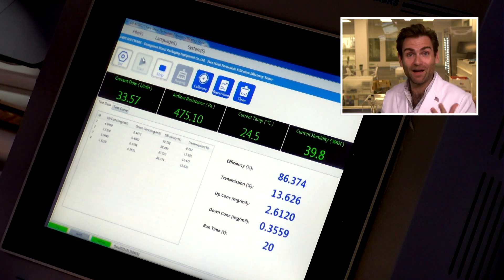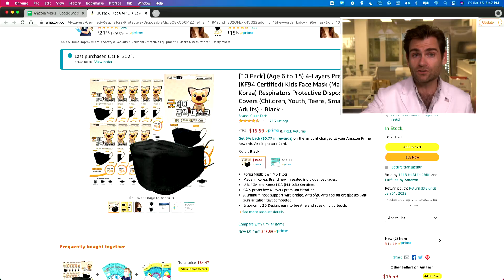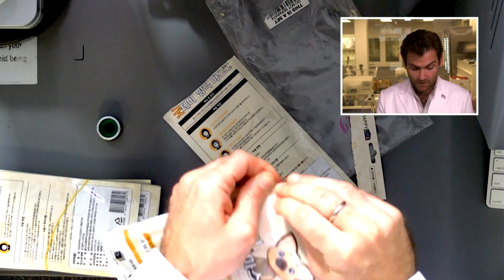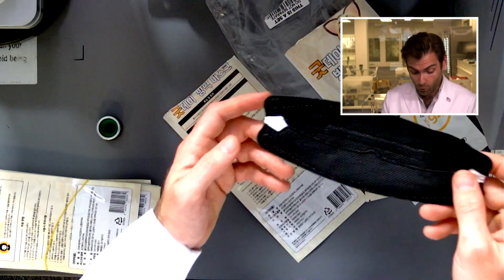This is an N95 machine — it's made to do the N95 test. We're using it to test these KF94s made for kids. Why? Because I don't have a KF94 machine because I'm not in Korea. Fun fact: the mask has to be made in Korea if you want it to be a legitimate KF94. And what I have found — we've found two or three fakes already from China — and some of them did not pass well. Some failed horribly.